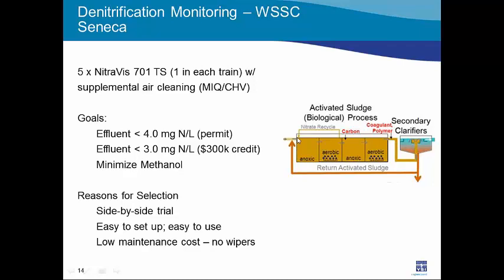The first anoxic zone is where wastewater carbon is used together with the return activated sludge and nitrate recycle from the first aerobic zone. So that nitrate, the carbon, and anoxic zones are created to denitrify. In the first aerobic zone, of course, nitrification occurs, increasing that nitrate concentration. The second anoxic and aerobic stages are needed to drive that nitrogen concentration even lower. So again, same thing happens.